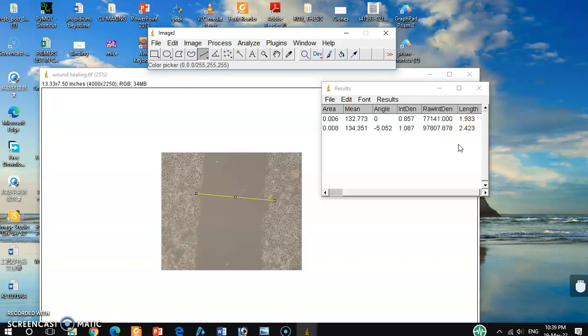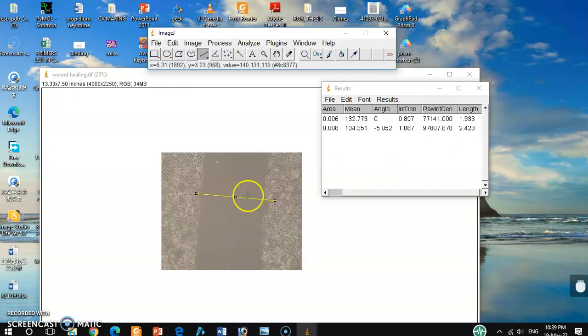By this way, you can use this method to measure your distance between two different cells and also for similar kinds of experiments. So that's it guys. I hope this video will be helpful. Thanks.